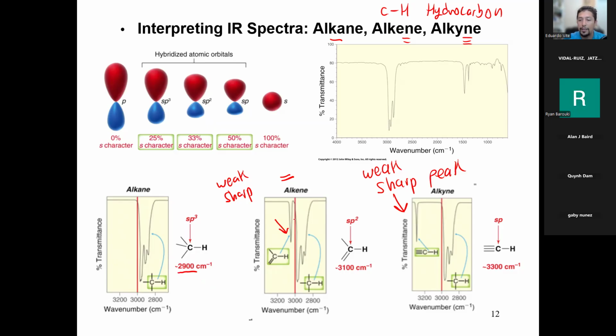And that peak that you have been observing, notice how it gets more towards the right. It flat out disappears because it comes in between this giant broad signal. This signal right here, I want you guys to look at this entire shape. I'm going to call this the stalagmite. If you guys have ever seen pictures of a cave, you see that there are these very pointy, spiky formations. If they're on the ground, they're called stalagmites. So these are stalagmites. That's what I call them. Other people have different names for them. These are everywhere.